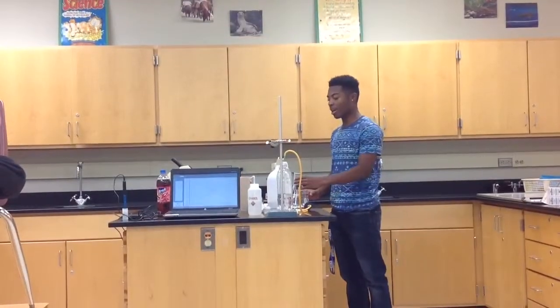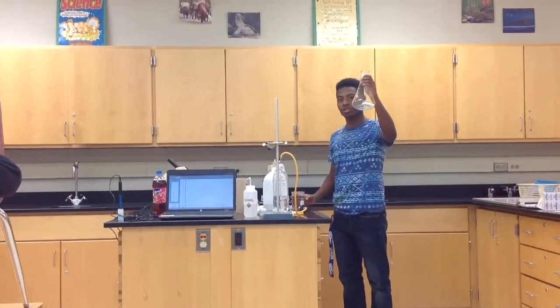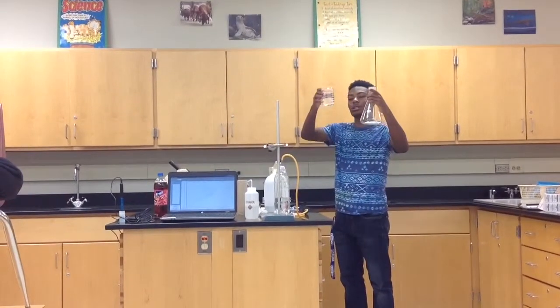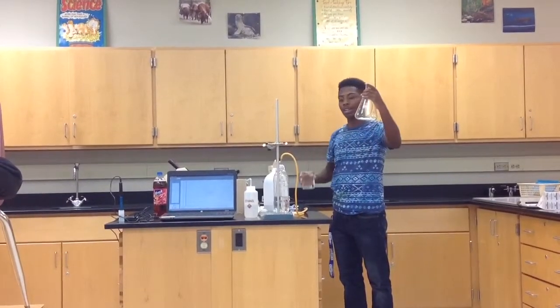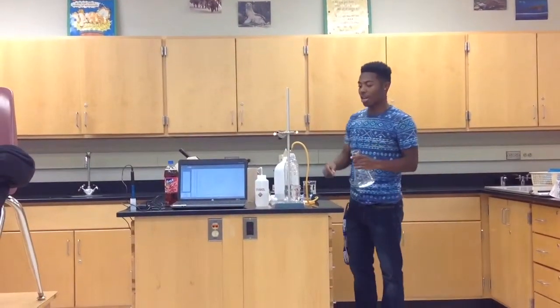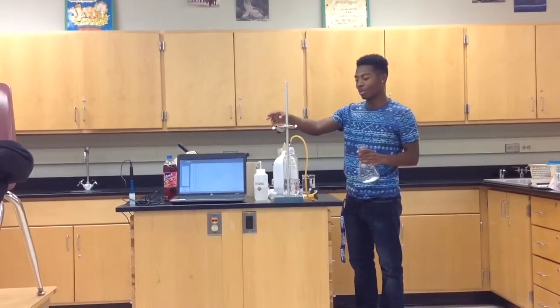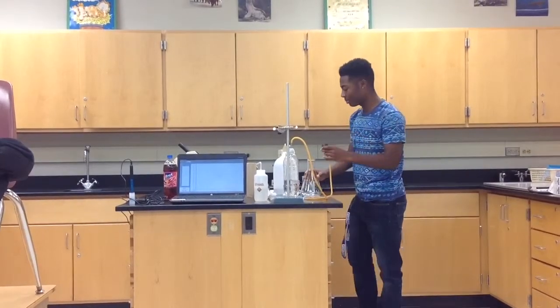This is the part where we have the CO2 reaction. We have a flask full of Alka-Seltzer tablets and 400 milliliters of water. I'm going to put this water into this flask where bubbles will be created, and the gas will go through this tube right here and create the CO2 gas, which will end up being measured by the pH meter over there. I'm going to put a stopper so none of the gas will escape.